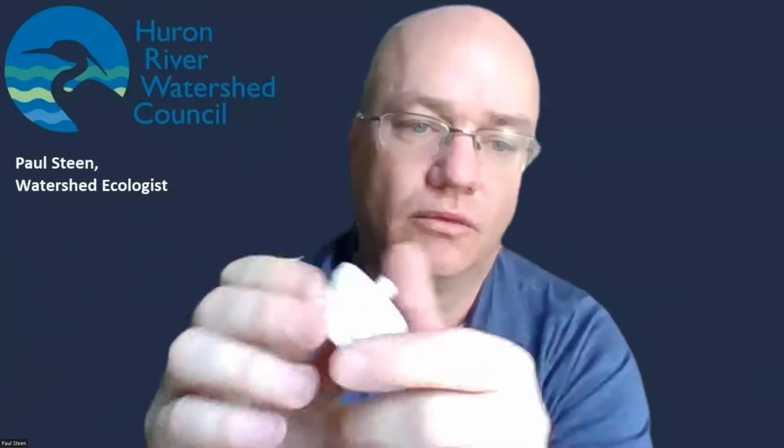The other thing I wanted to show you close up is this strange contraption. This is called the filter holder. So this is where your little piece of filter paper will go in. This thing unscrews, and in here, there's a little rubber O-ring to get a nice tight seal when you got your filter paper on there. So don't lose this. You need it. Without this, the whole thing will leak, and you won't get good samples.